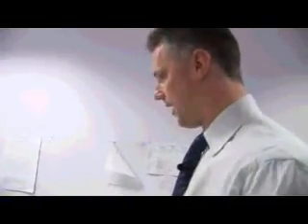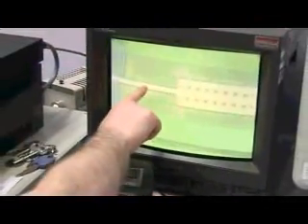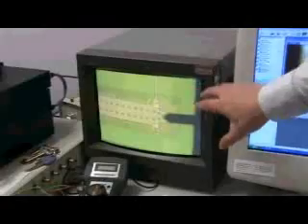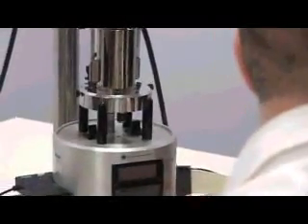So Greg's actually working on a project with the National Physical Laboratory, where Greg is designing a new type of probe, the needle I was just talking about, and trying to design one that's better for the kind of work that we do. So this is a collaboration between us and physical sciences, which is something we like to do. Yeah. Actually, this scale is not that small. This is just an optical camera. Okay. But this needle that Greg was talking about, this has the very sharp nano needle behind it.